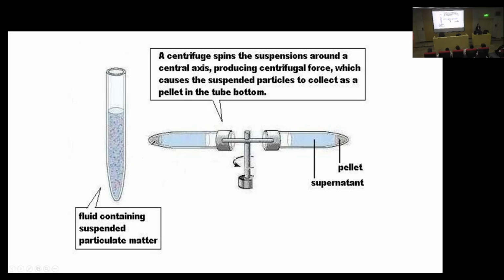So this is again centrifuge. And remember, centrifuge is used as a separation technique, and the best example is blood. But I can use it if I'm growing cells. I could be growing cells in a dish, and you know how we have to add a media to the dish, right? So if I want to wash the cells or collect them and plate them somewhere else, I will harvest the cells, and they will be floating in a solution, in a liquid.